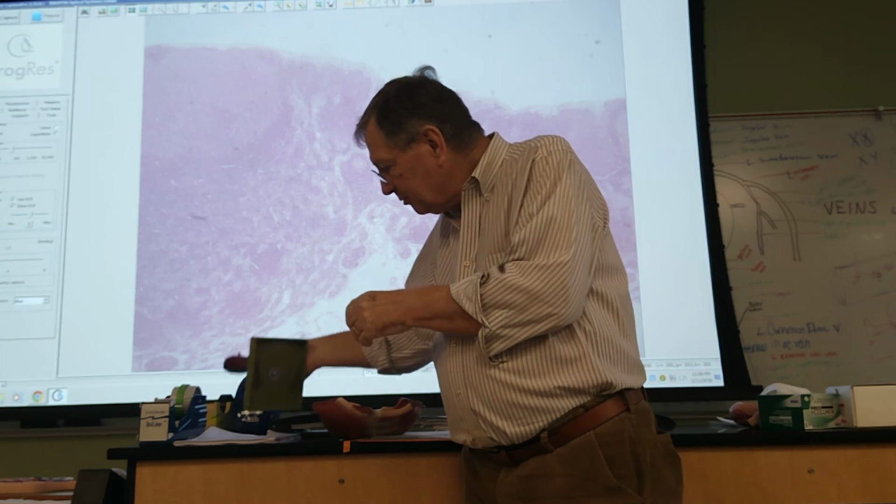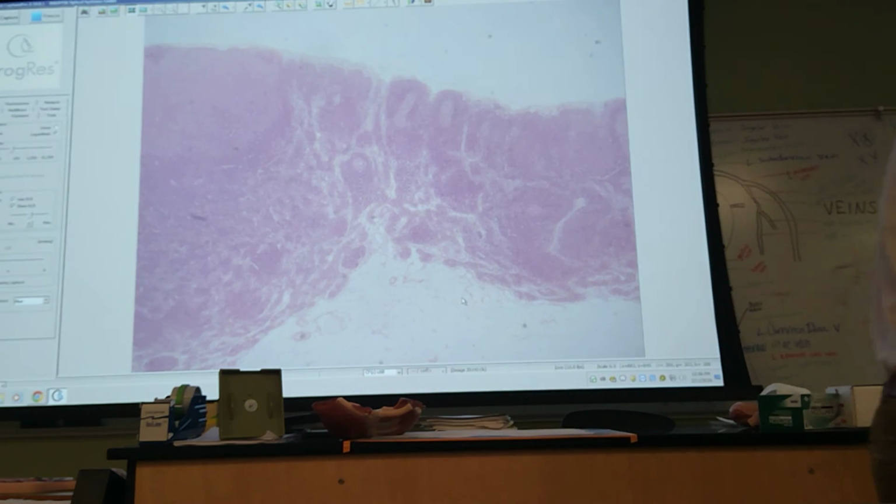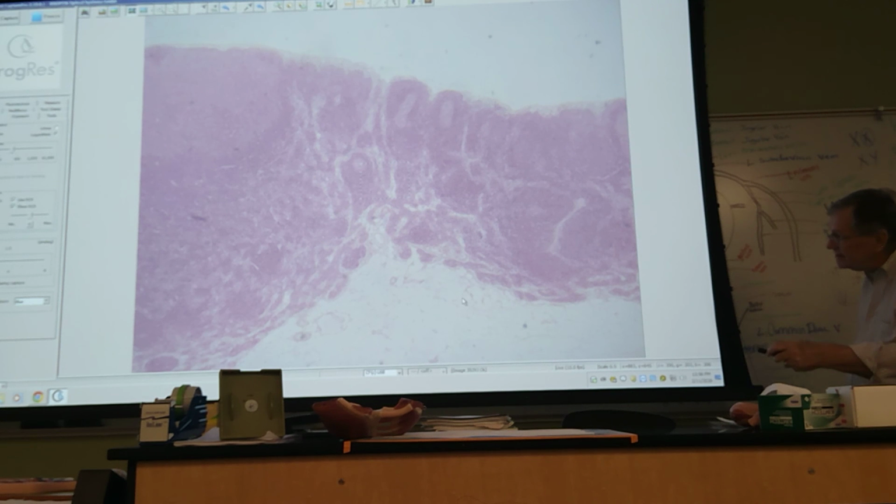All right. So we want to find that in our spleen. And we have it. There's a lot of adipose. This area coming in, there's a blood vessel coming in. So this area here would be a hilus or hilum. Either one. Okay? Again, nothing but an area, an indented area that has vessels going in and out.